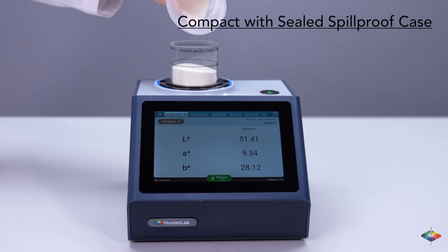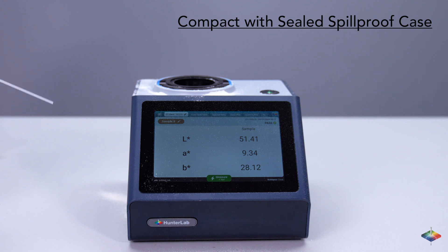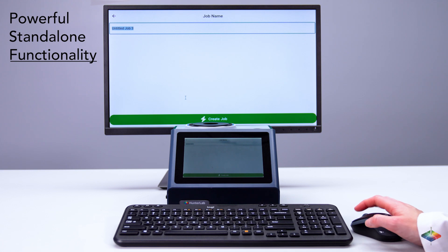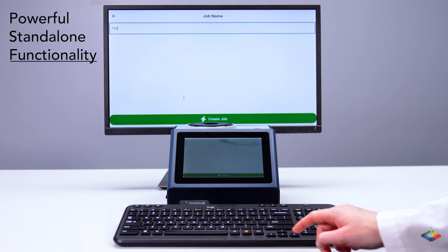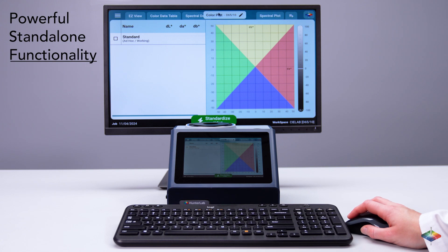Its space-saving design and sealed spill-proof case ensure easy maintenance and durability in busy lab environments. With an onboard computer and huge storage capacity, the ColorFlex L2 can function as an independent color workstation. Connect a monitor, keyboard, and mouse if desired.